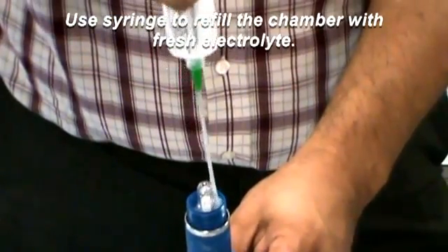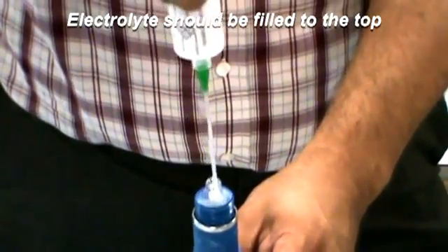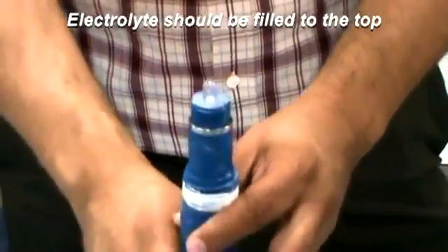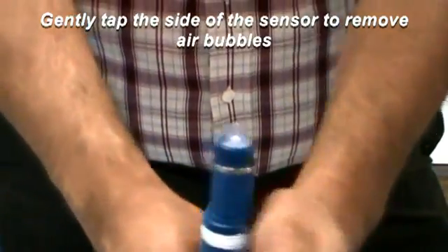Fill the electrolyte chamber up with fresh electrolyte solution found in the PerfX rebuild kit. Make sure the electrolyte is filled to the top of the chamber. Gently tap the sensor to remove air bubbles from the electrolyte.